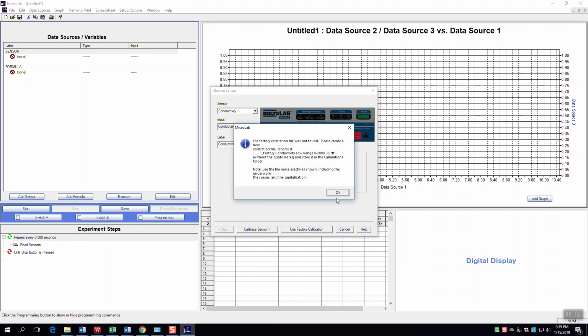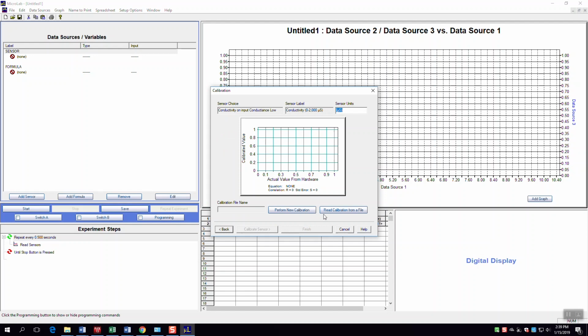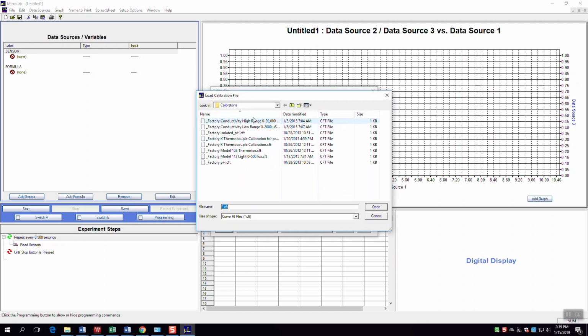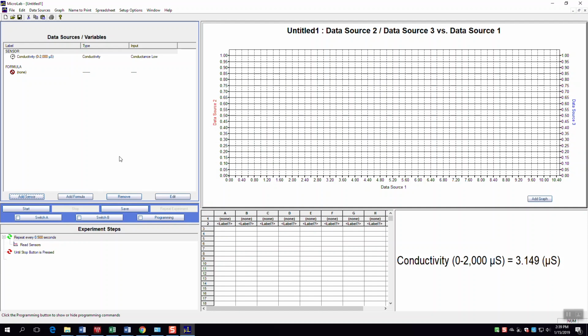You'll see here in the bottom corner that we have a conductivity reading, and currently there's a small number there because I have a wet conductivity probe that has a little bit of water still on it, so it's reading a very small conductivity. First, I'm going to stick it into the tap water to measure the conductivity. So I've fully submerged the conductivity probe. You can't see it, but it is fully submerged beyond the gold band, and you'll notice that the number is bouncing around. The number is around 138, but you'll see that the decimal points are changing pretty regularly.